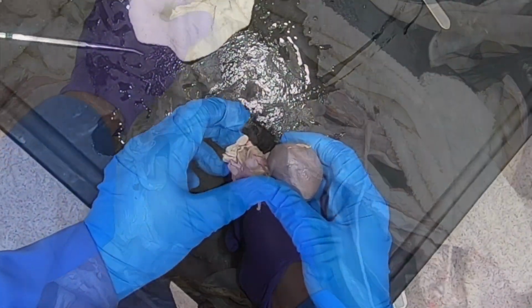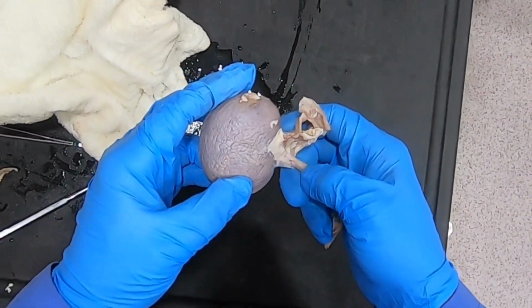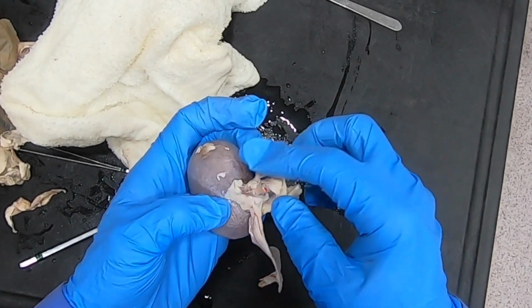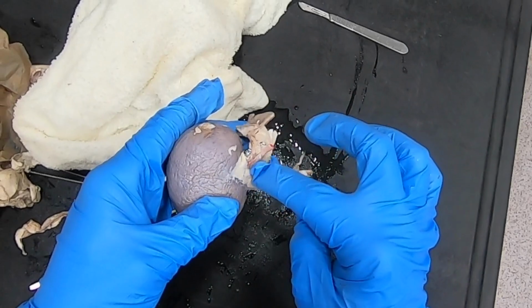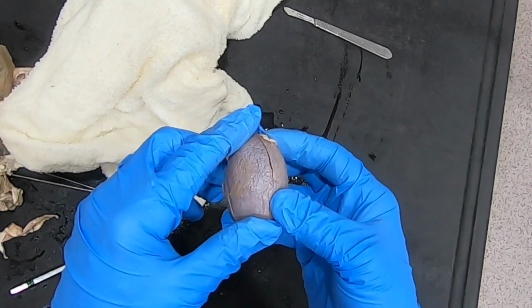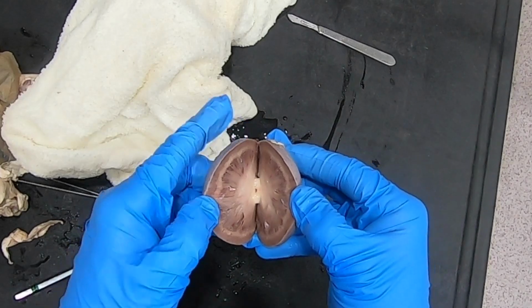But this is the adrenal gland. Okay. So real quickly here, I wanted to show you the kidney of the small ruminant. So we have our renal artery and vein coming in, as well as our ureter coming out at the hilus. We've got a cranial and a caudal pole. Looks very much like the dog kidney. We opened it up and it still looks very much like the dog kidney.